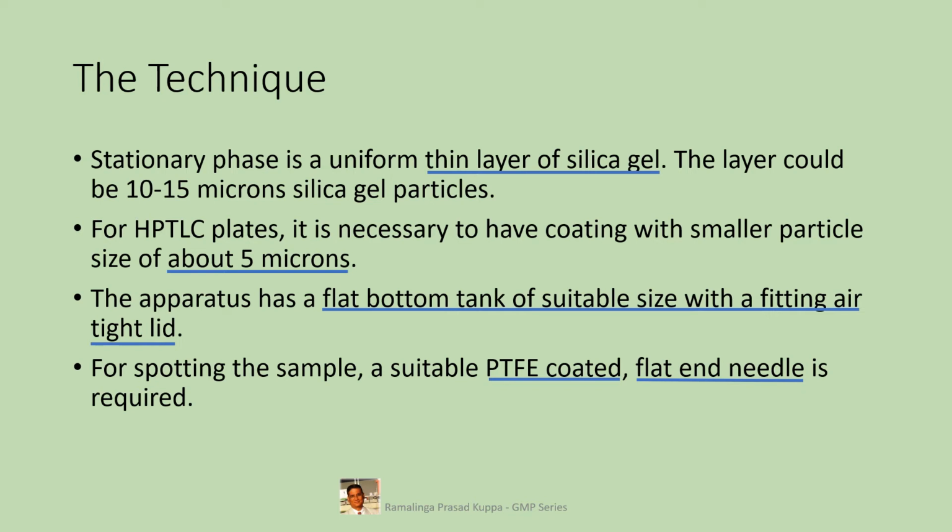If there is no syringe readily available, there is an alternative. Take a capillary tube, hold the two ends carefully, and expose the center of the capillary tube to the flame of a Bunsen burner. When the center portion becomes red hot, pull the ends slowly away.